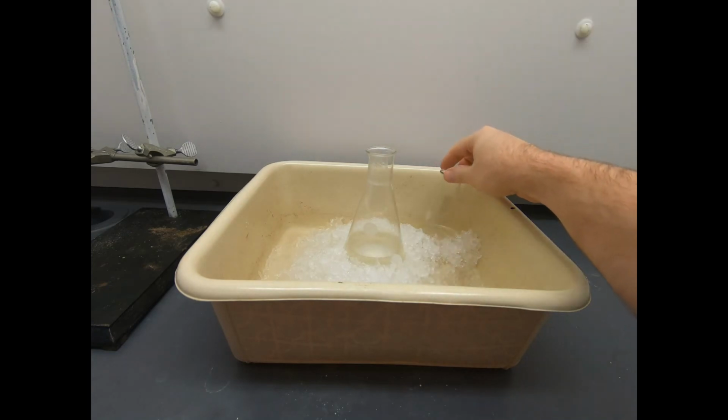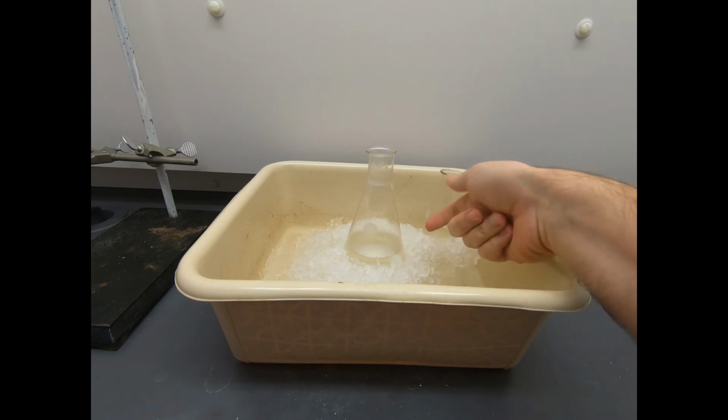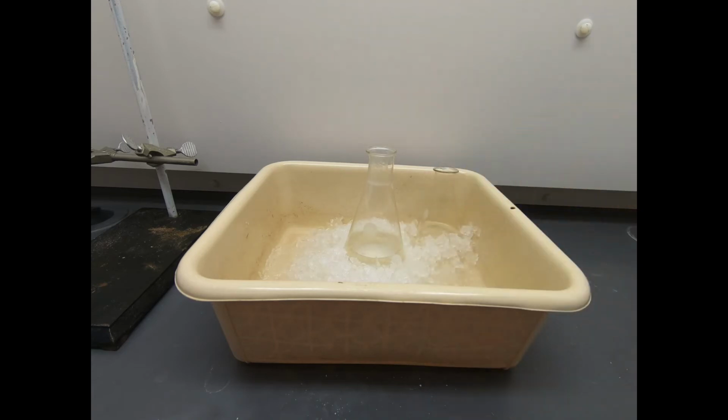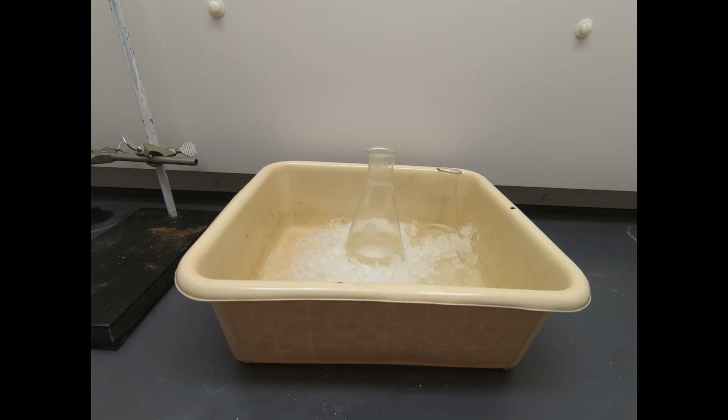Now you notice there's a second flask over here. So this is water with a little bit of sulfuric acid and our product. This is just water with a little bit of sulfuric acid, and I'm cooling that as well. So we're going to end up doing a filtration, and we want to make sure that everything we use is nice and cold. So I am pre-cooling some of our liquid to make sure that we can rinse with cold liquid as well. You don't want to use warm solvents when you took the time to cool something down. You don't want to just rinse it with some warm or room temperature solvent and risk dissolving more of your product right back into your rinse solvent.